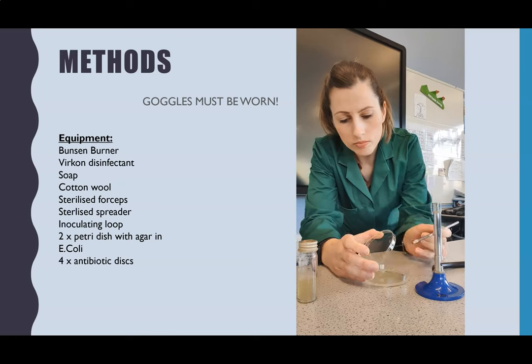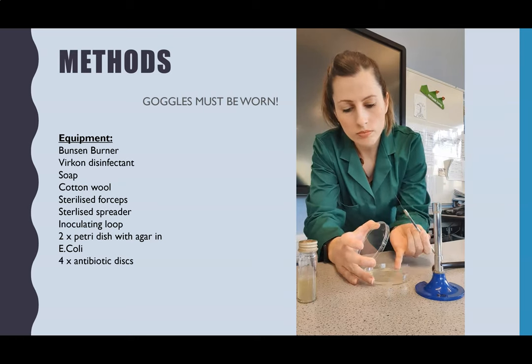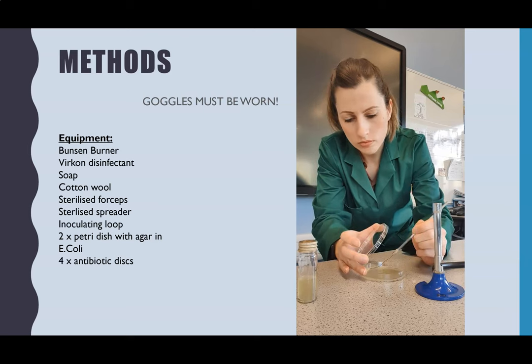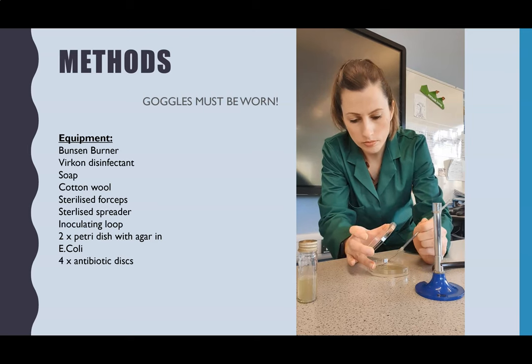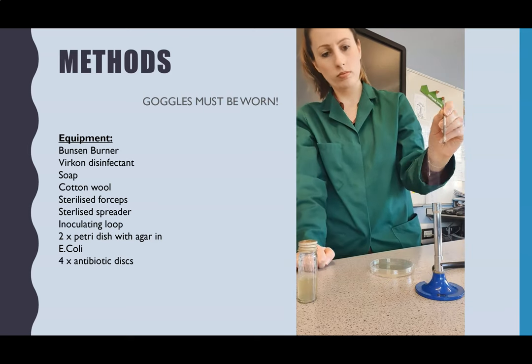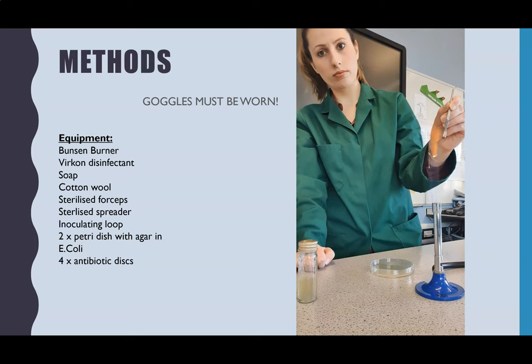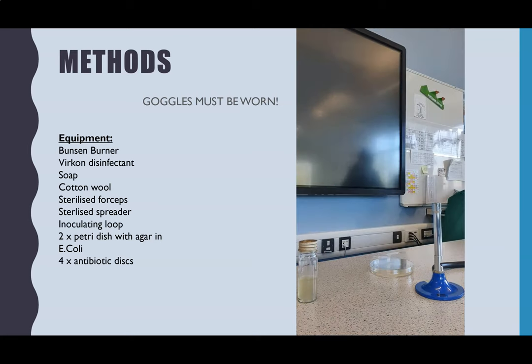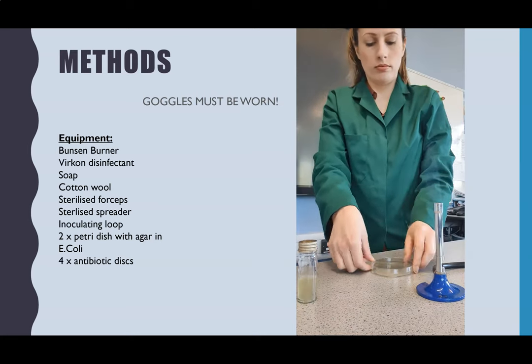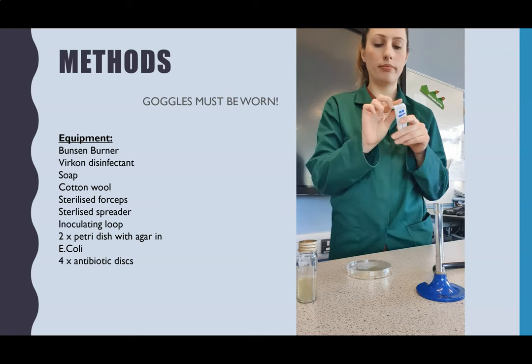Working near the Bunsen burner with the lid tilted open, I'm doing my streak plate as quickly as possible. Once finished, the lid goes on and then I sterilise the inoculating loop again to kill the E. coli before putting it onto a surface. Finally, tape the lid on so it doesn't fall off — but don't tape it all the way round, because you want oxygen to be able to get in.